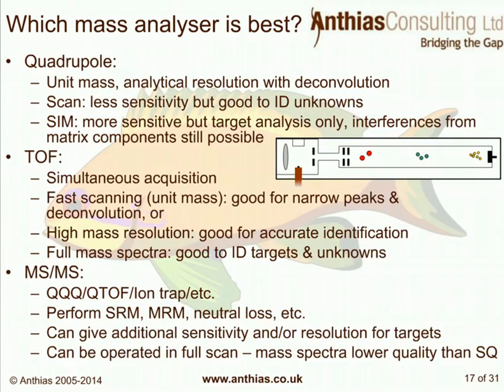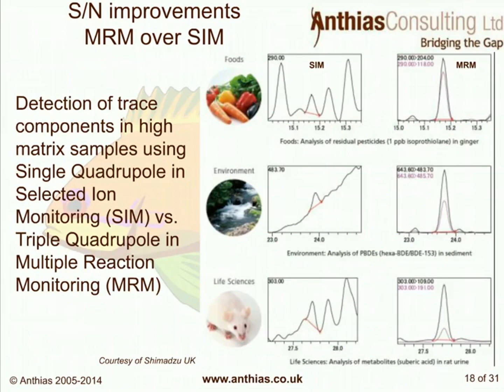Comparing MRM (multiple reaction monitoring) on a triple quadrupole versus selected ion monitoring (SIM) on a single quadrupole: in a food sample example, the SIM peak is quite difficult to identify and quantify due to co-eluting matrix peaks at the same masses. With MRM on a triple quad, the picture is much cleaner, giving much more confidence that the peak is the target analyte of interest.